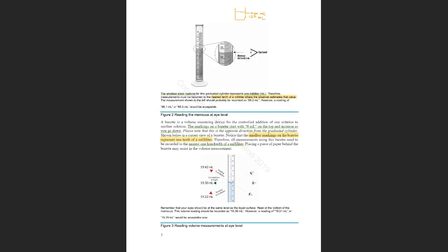And then we are using here, this is a graduated cylinder. If you see the graduated cylinder, the scale starts at the bottom. So here is the 0, and it increases the number as you go up. Here you have 100 mLs.